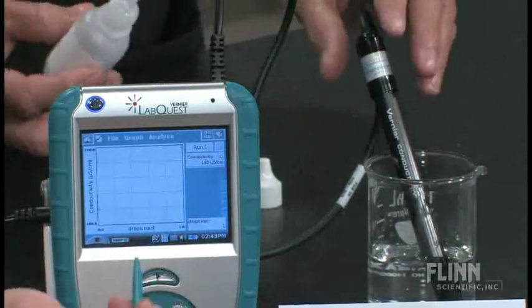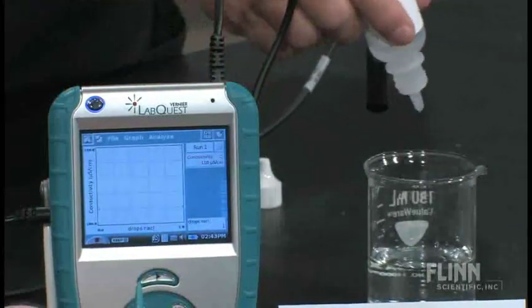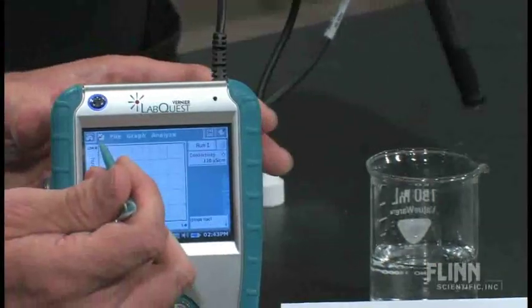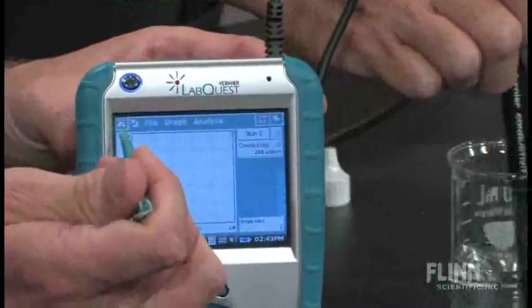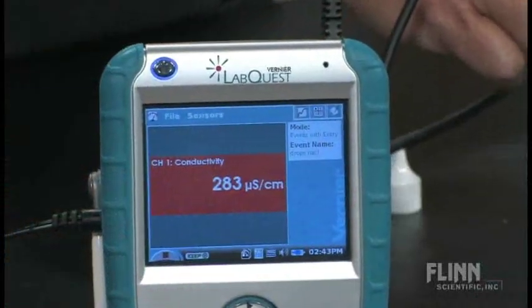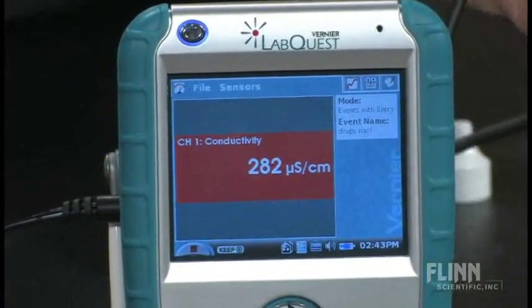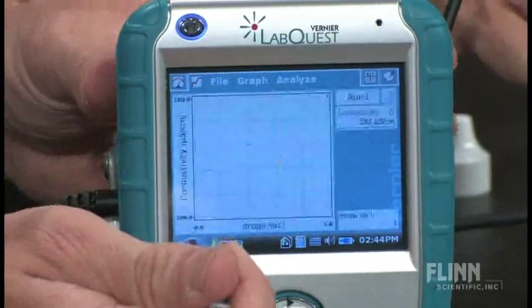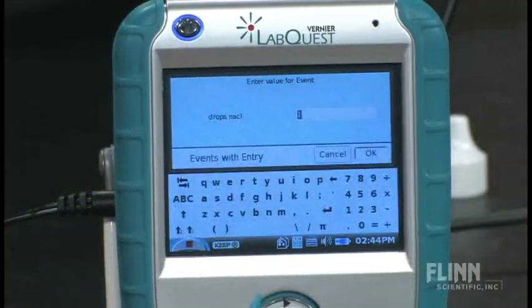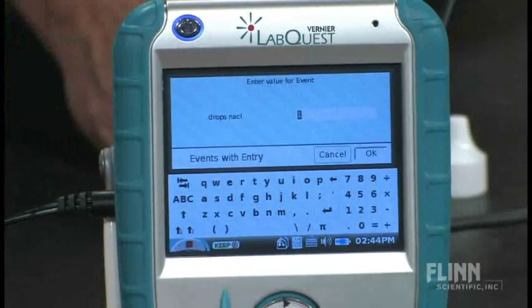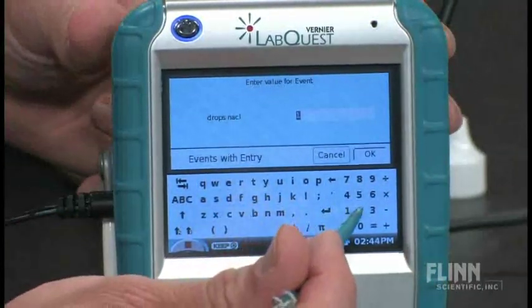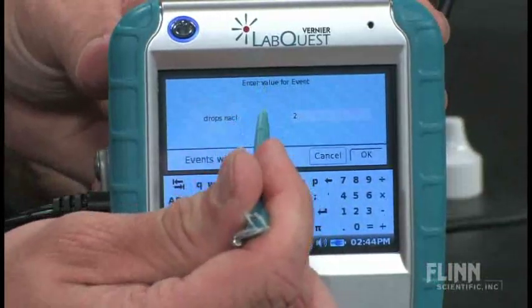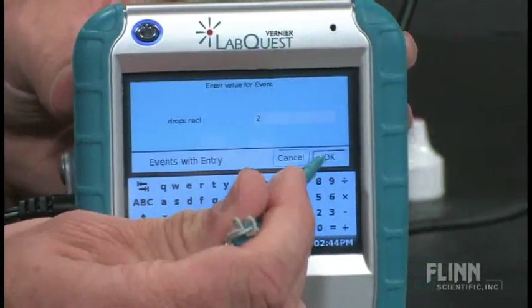If we put another drop in and give it a swirl. We're just going to continue to do this and watch that. We see it increasing. We want to get a keep on that. Now we won't go back to that meter anymore. We'll just stay with the graph so that we can get through a couple more drops. Two drops, right? I have two drops in there currently. And I click OK.